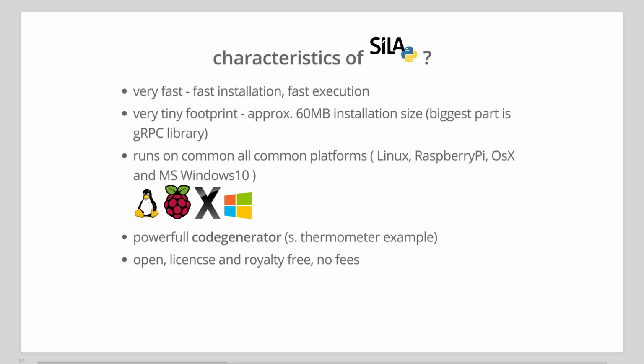And the only thing you need to do as a developer is then to add the hardware-specific part of your implementation, and then you have a very fast prototype of a SiLA client and server.